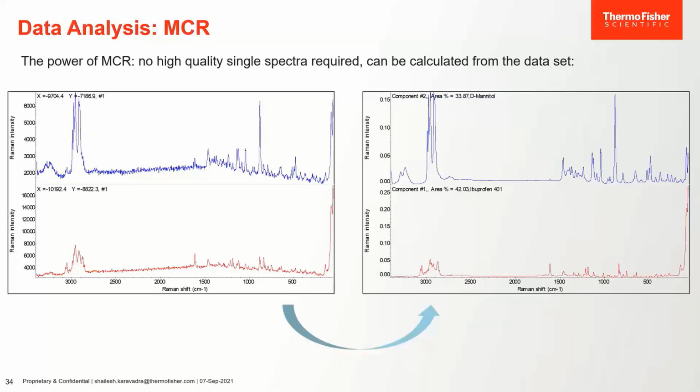Multivariate curve resolution, or MCR, with constrained alternating least squares is a powerful method for deconvolving overlapping spectral signals from chemical and biological reaction systems. The intended purpose is commonly the estimation of concentrations of individual components or the identification of unknown spectral profiles in complex mixtures or aqueous solutions.